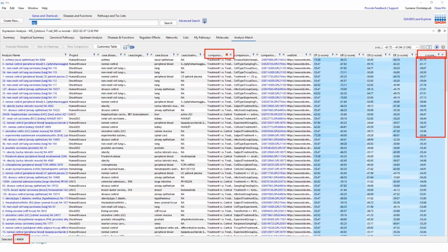And here you can see that some of the treatments that were utilized was IL-2. I see another IL-2 here. So some of these drugs are showing up very clearly. Now, these are treatments that were utilized externally. So whenever you have a metadata that says treatment, it means it was an ex vivo treatment.